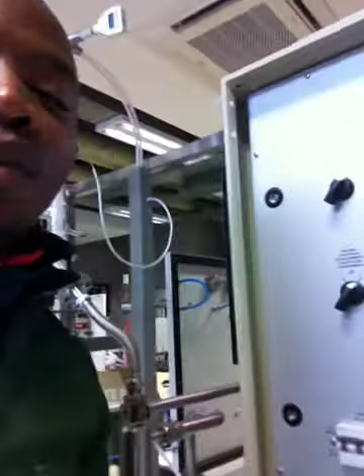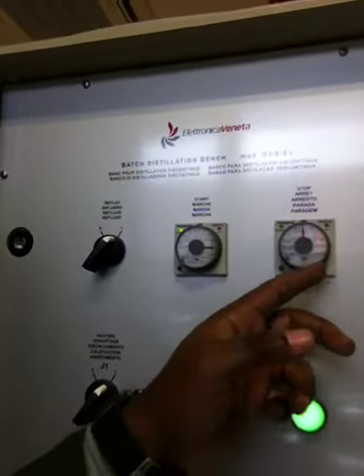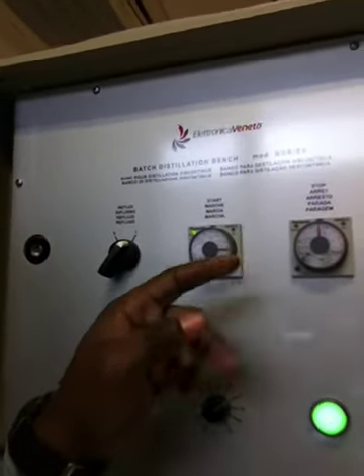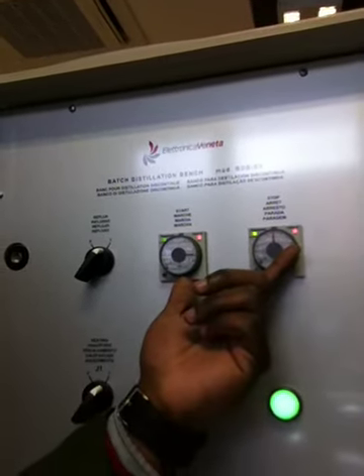Now representing this part, normally this part represents the main part of the process, which is the switchboard. We can also call it the motherboard. It's got a couple of pieces to know. Here you have the reflux ratio. Both of them play a main role, whereby this one is just to adjust the timing.